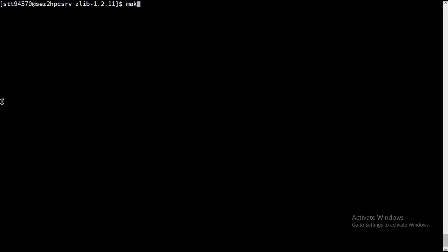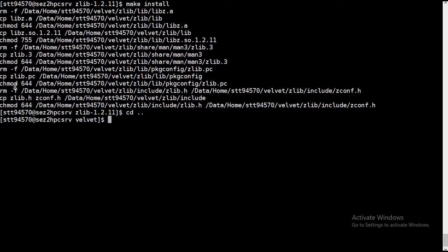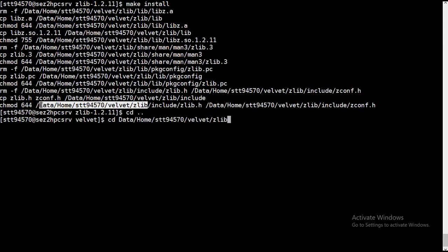It's installed in this directory, which is data home std with Zlib. So if you go inside this directory, we'll see the files folders, and in that we'll get included library files.